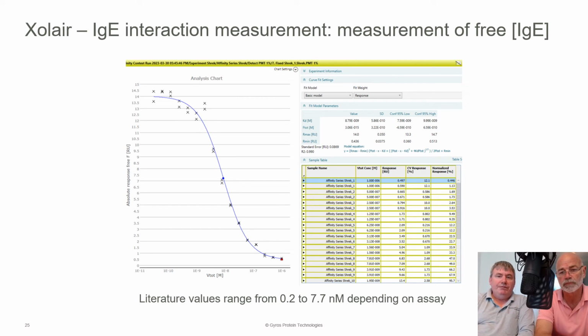Yeah, one kind of important point is that it's about overall modeling. So you want to make sure, as we've said earlier, you want to define the upper and the lower end of the curve. And a lot of the time you will see a lot of scatter, particularly at the really high responses, because you're talking about really little changes. So do not be concerned about this. It's the overall model that matters.